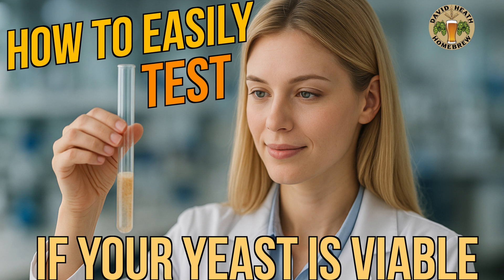In this video I will be showing you a very simple and fast test method that will allow you to determine if your yeast you are planning to use for a brew is still viable. This method works with both dry and liquid yeast and requires just a very small amount. So let's get to it.